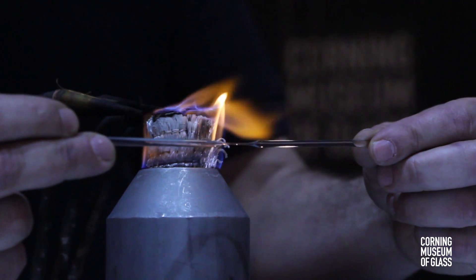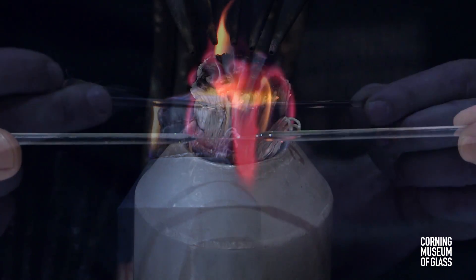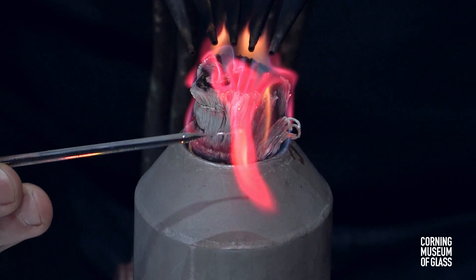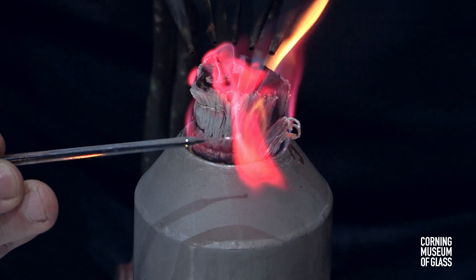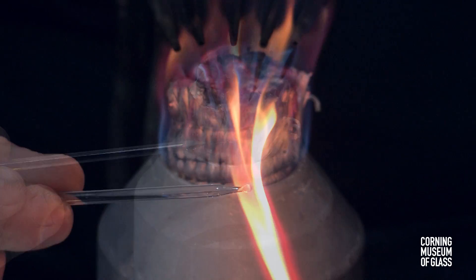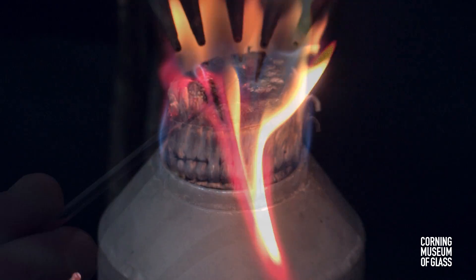Heating a rod of glass allows it to stretch into a thin thread. Rotating this thread creates a glass ball. After it cools, this bead is a magnifying lens usable as a microscope.